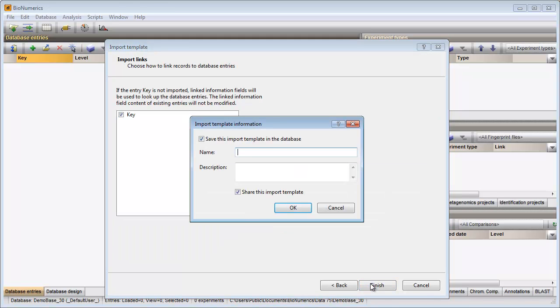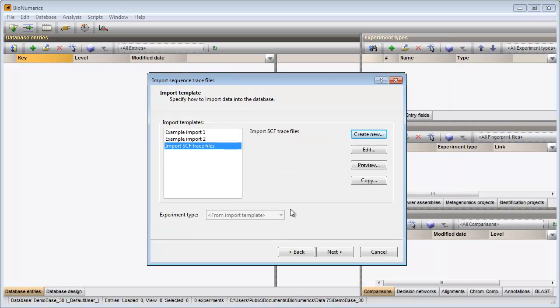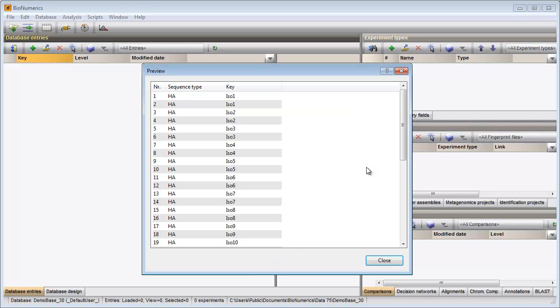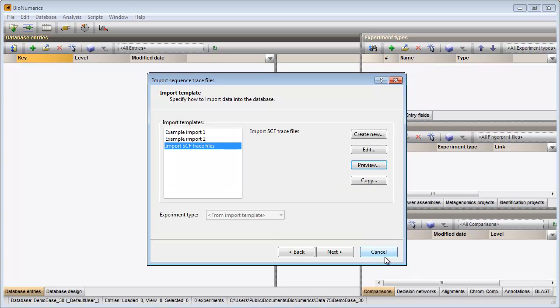In the last step I need to specify a name for my template. My template is now added to the database. I can check the preview again and see that all information is now parsed correctly. I make sure my newly created template is selected and I can go to the next step.